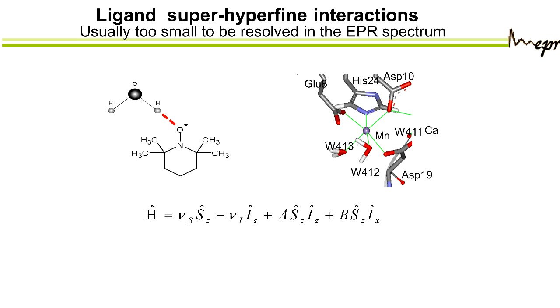spin Hamiltonian. So although we have large hyperfine couplings to the copper, usually we can ignore them, and we look mostly at the important parts, which are the Larmor frequency of the nucleus. So this is the term that has Ni, and then we have the hyperfine coupling.